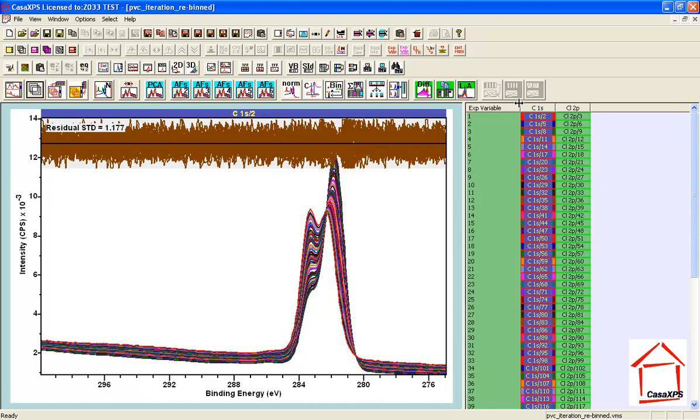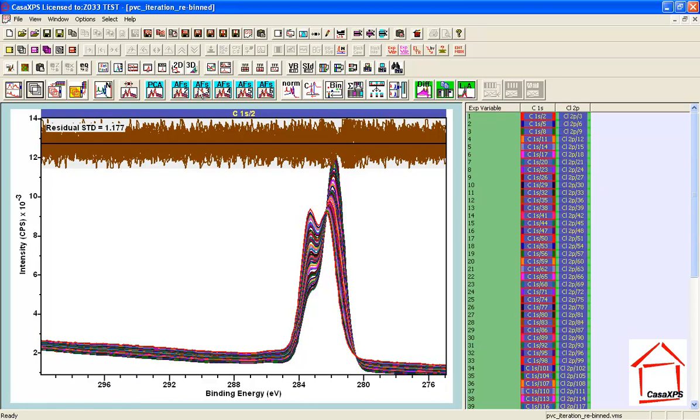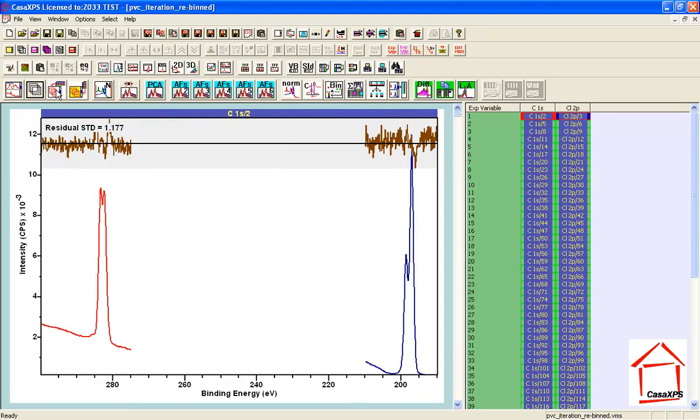Now, having created these what I hope are superior spectra, I'm going to use another display option on this processing toolbar. It is a display option, but what the toolbar does is it collects together all the relevant operations that you might want to perform on data en route to this type of analysis. So hence, when I press this button, although it does also exist on another toolbar button, it's here and available for processing of data of this form.